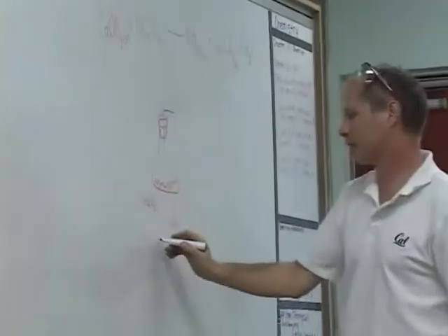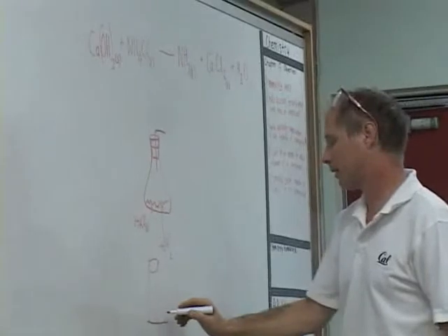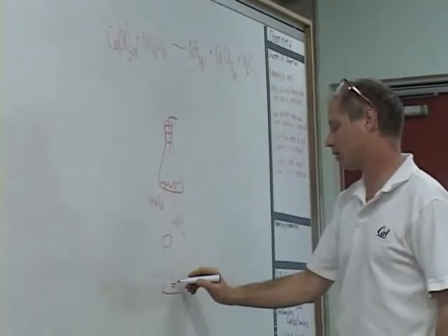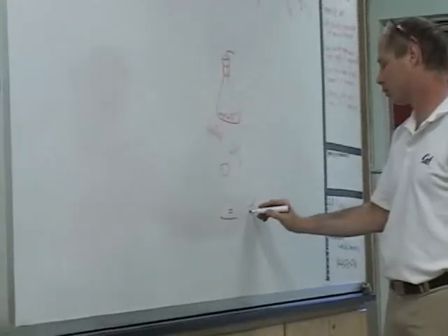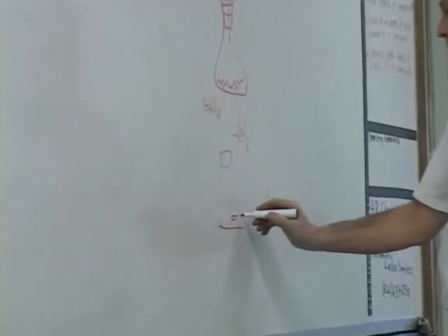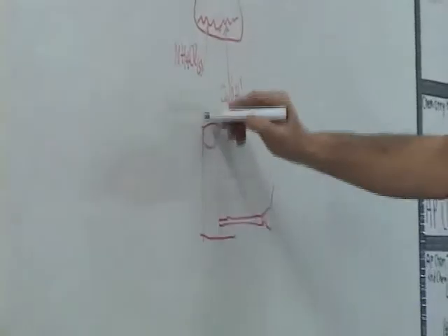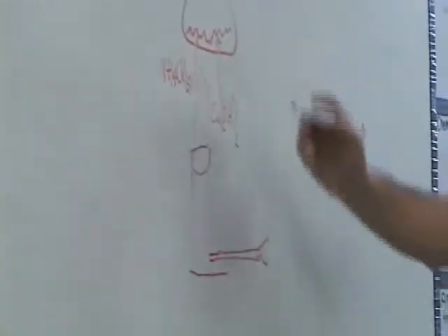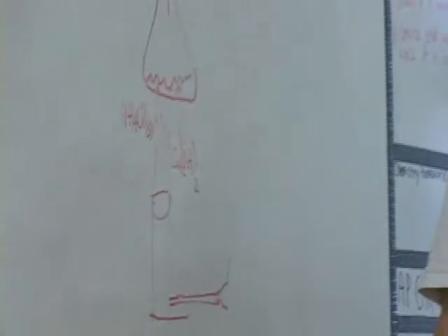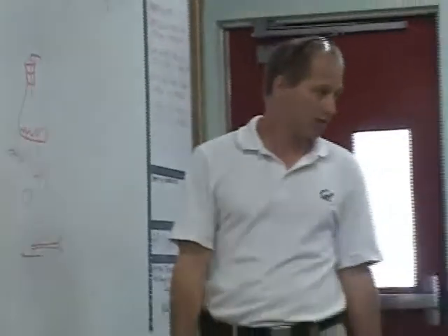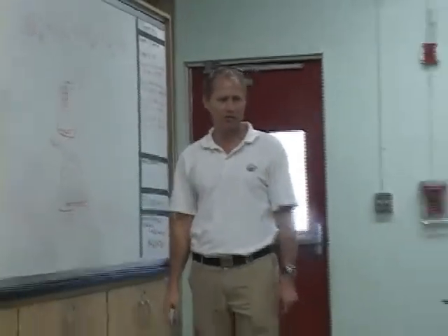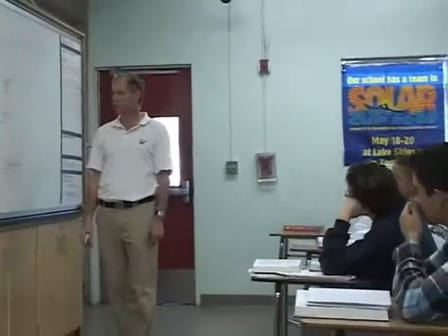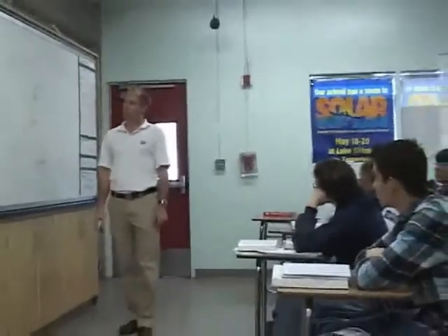Now I'm going to make... I have a Bunsen burner, and then here's a little handle and a spigot. The gas is coming out, we've got fire. This reaction happens. If this reaction doesn't occur until I heat it, what kind of chemical change is this? Is it exothermic or endothermic? Exothermic.